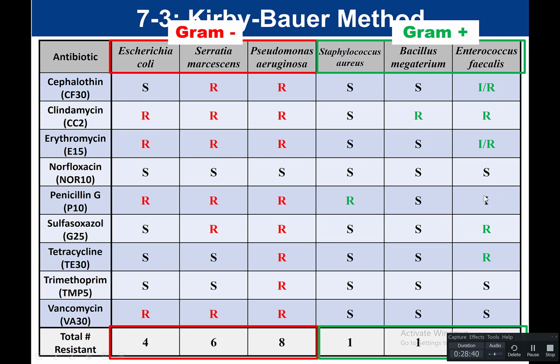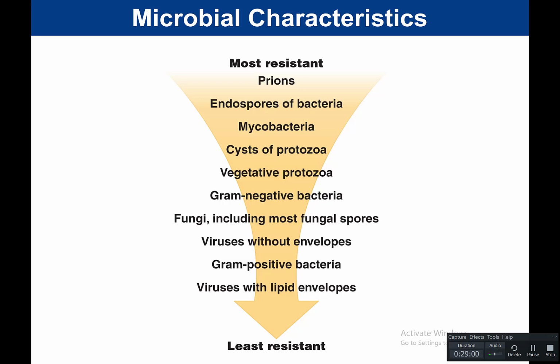And so similarly, there's one here that's just an I. Again, if we have drugs that bacteria are sensitive to, typically those are the ones that we are going to use for treatment. We're not going to use the I ones, the intermediate susceptibility, because we would need a higher than normal dose.